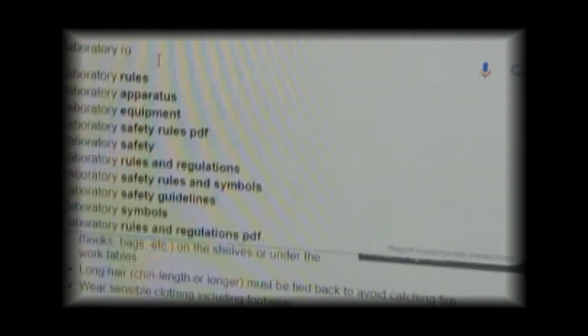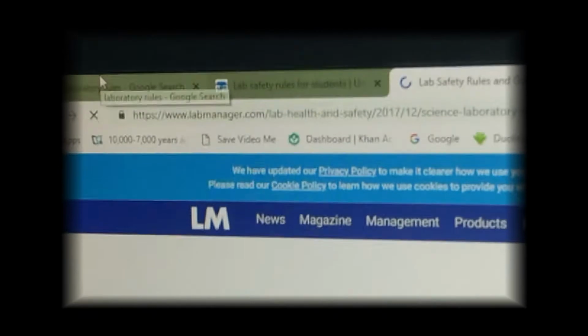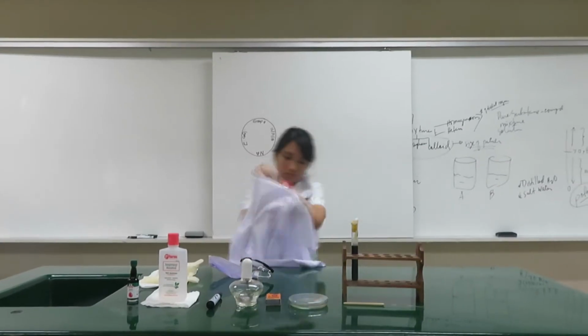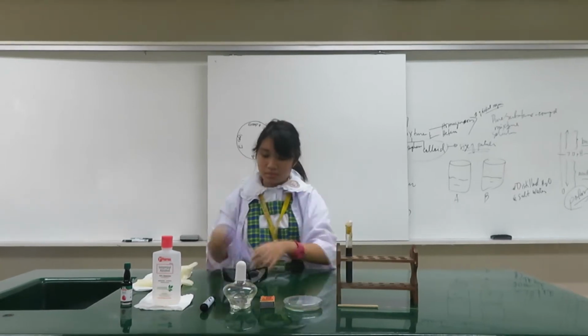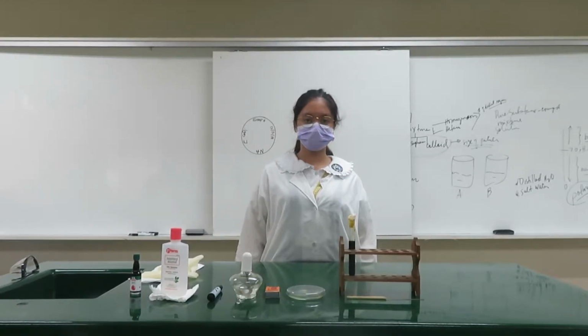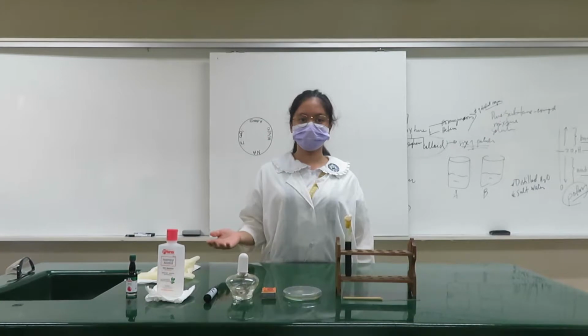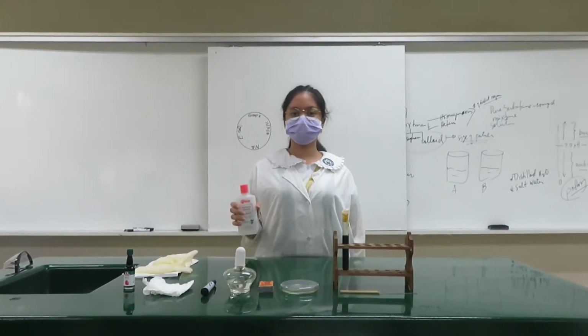1. Familiarize yourself with the laboratory rules and safety precautions to be observed when handling microorganisms. In line with the rules, do not forget to wear the proper attire for working in a laboratory. 2. All instruments, solutions, and media should be sterilized before using them for the plating.